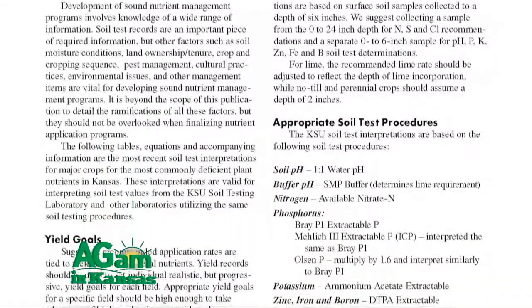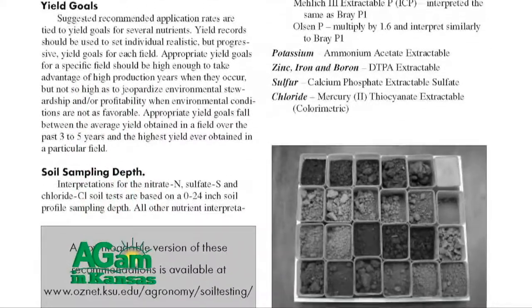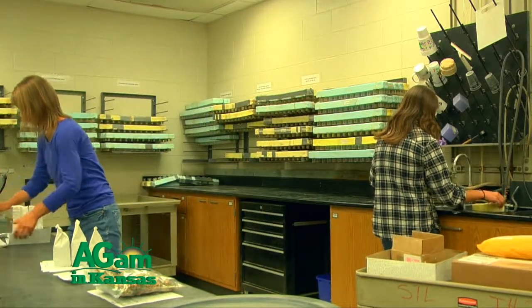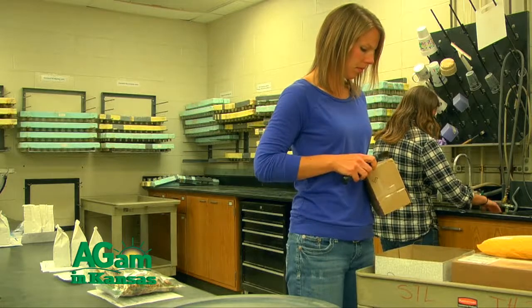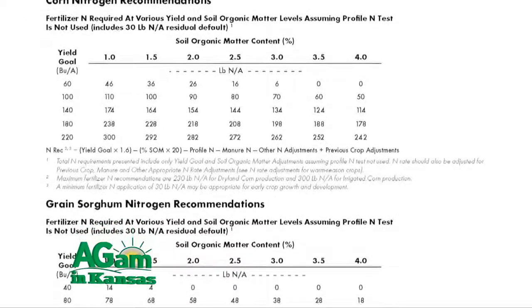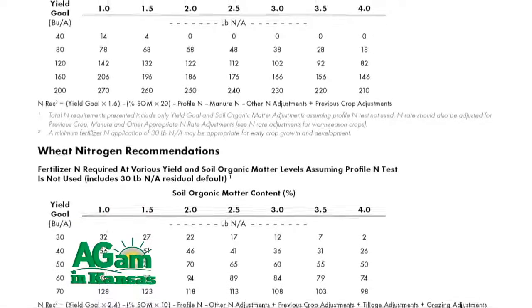And I think that's perhaps one of the most important aspects also that we do here in the lab, and we provide that information. So the Soil Testing Lab just doing the actual analysis is just half of the issue. It's the recommendations and what the producers or homeowners do. Absolutely, and that's a very important part of the mission that we have, because providing accurate, specific information for soils and environment that we have here in Kansas is a key component, and for that we really require extensive research, to do correlation, calibration, make sure that soil tests that we are using in Kansas are the appropriate ones for the soils that we have here in the state.